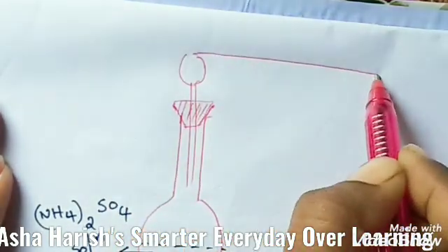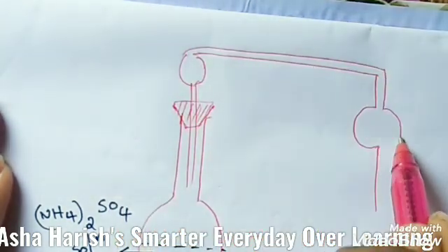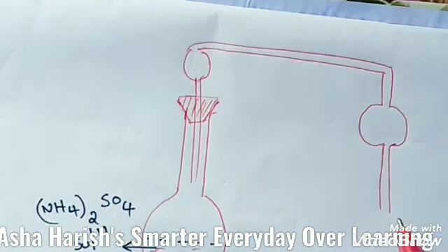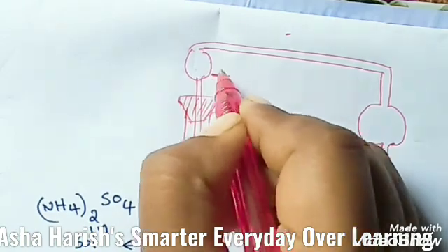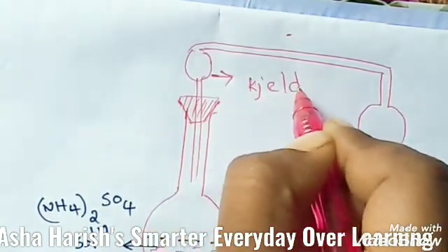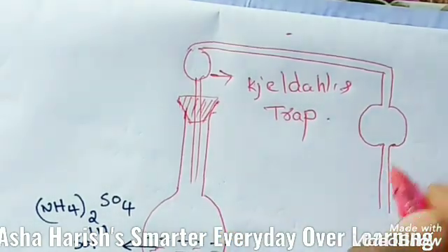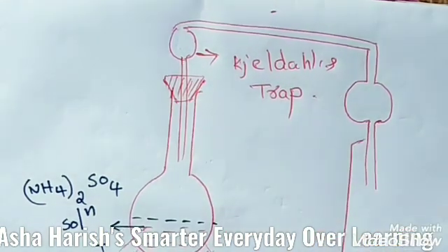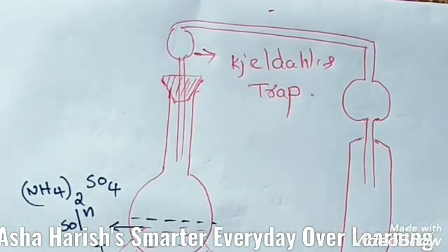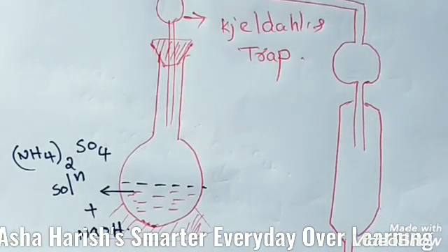just like this. Here is a bulb, and here you need to connect. This is Kjeldahl's trap. Here, just like a condenser, one arrangement should be there, just like this, just like a condenser. Here is the end of this.